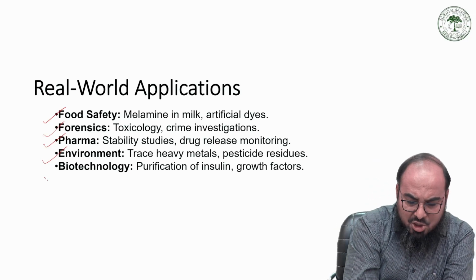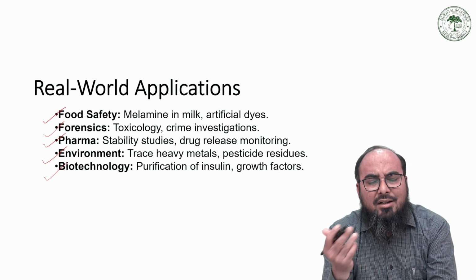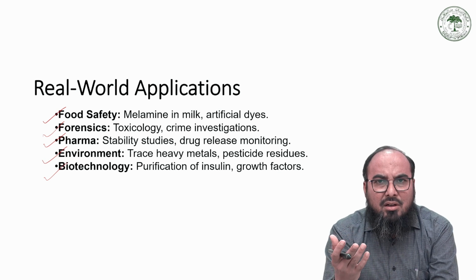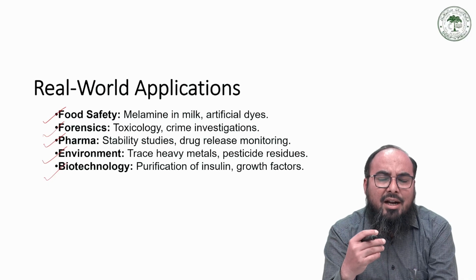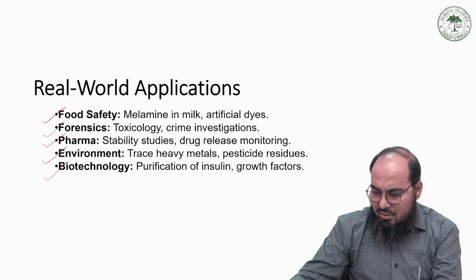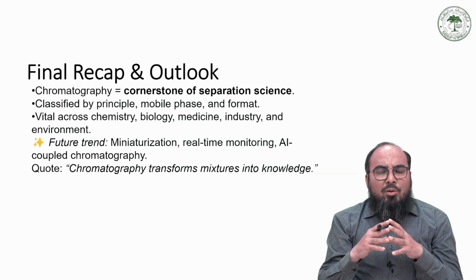Similarly, for the purification of hormones, for example, insulin, or certain growth factors, by using affinity chromatography you can have a very good idea. You can detect to a very good sensitivity. So with this, we can have the chromatography.